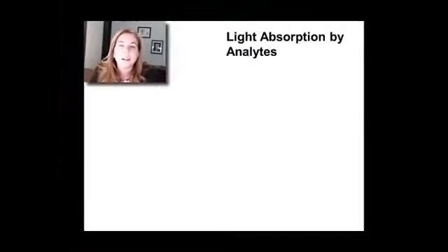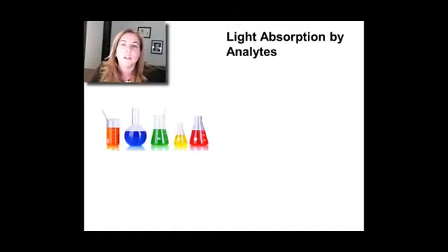The most important thing to realize about the absorption of light by any sample is that the color you see with your eye, if you're fortunate to be able to see the color, is actually not the color specifically that's being absorbed. That's a really counterintuitive but important point. I'm not going to go into it too much because it's more about perception of color, and spectrometers get around that. We don't use our eyes, luckily, when we do spectroscopy. We use detectors, but nevertheless, you should understand it intuitively.